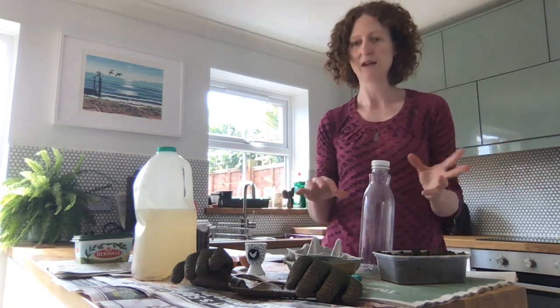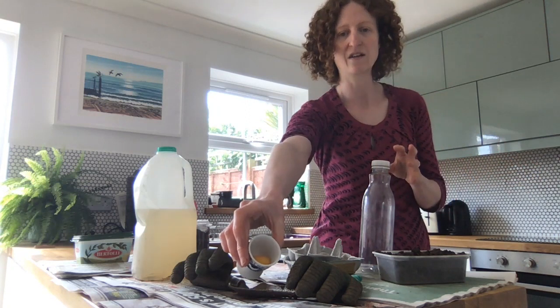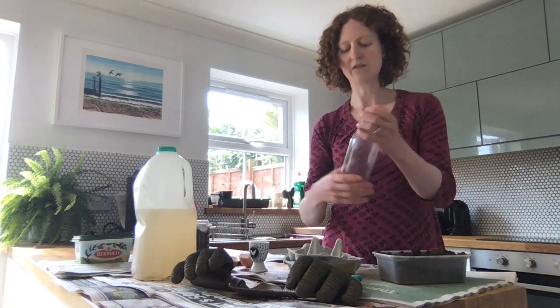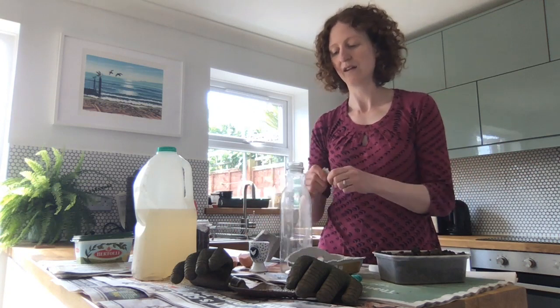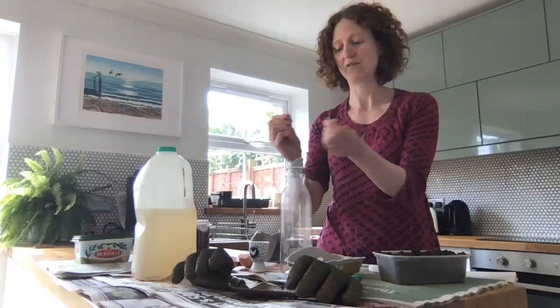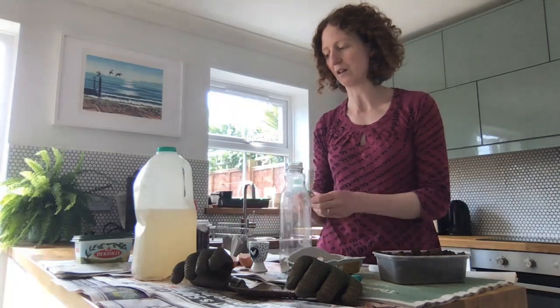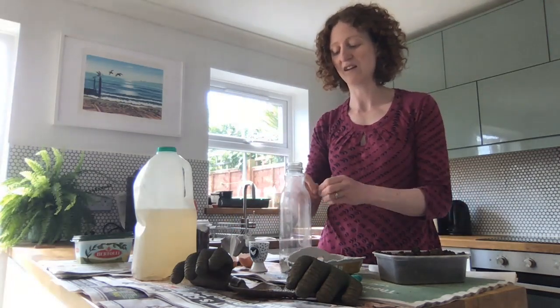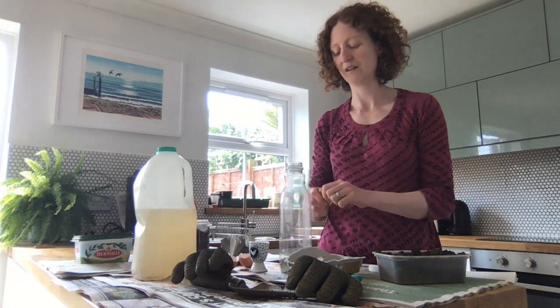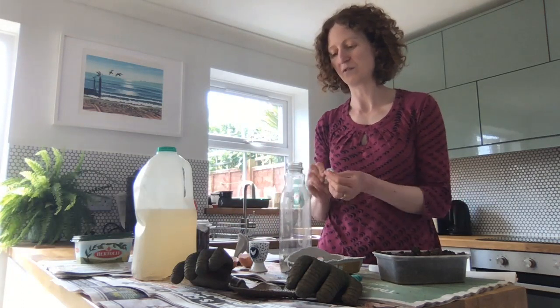And then if we want to get some of the purple and green bacteria growing in here, then we want some sulfur. So I'm just using an egg yolk in here to give them those. So first of all, at the bottom of our bottle, we're going to put those bits in. So cardboard or paper just gets ripped up and pushed down, about a quarter of the way up our bottle or jar. It can be a vase, a spaghetti jar, an empty plastic bottle, whatever you've got to hand.